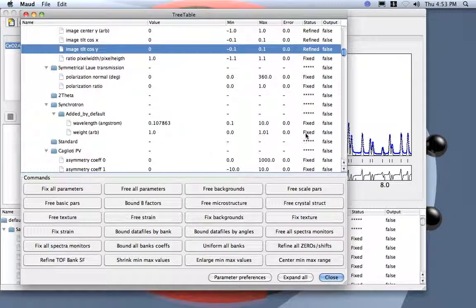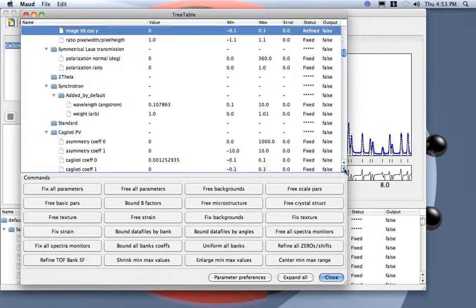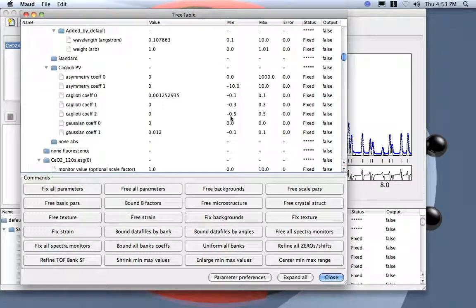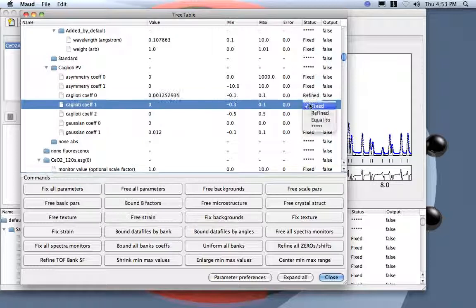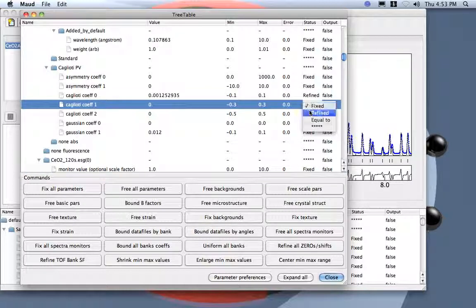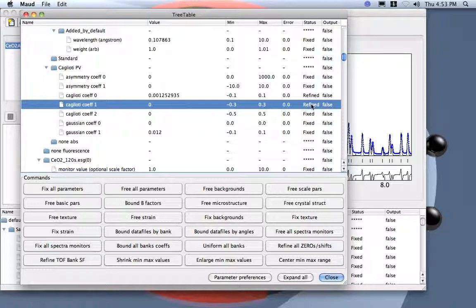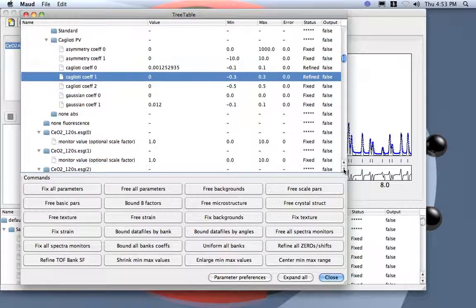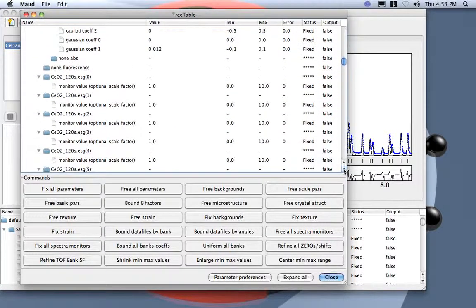So the wavelength we leave fixed. And then we can refine also the Cagliotti. Here already, the Cagliotti we just refine two parameters. We may use three of them but two are sufficient. And the Gassel coefficient we prefer to refine later.